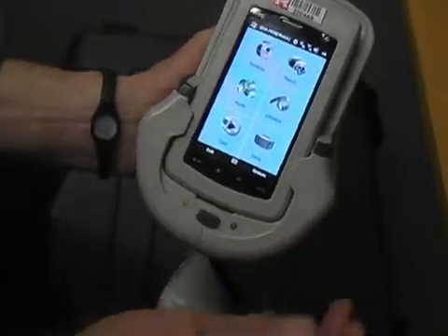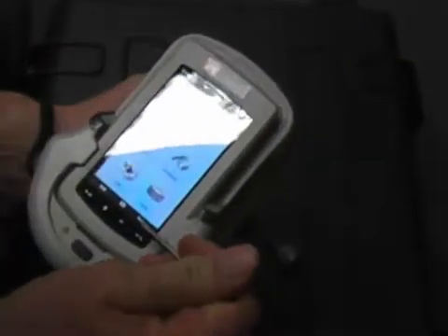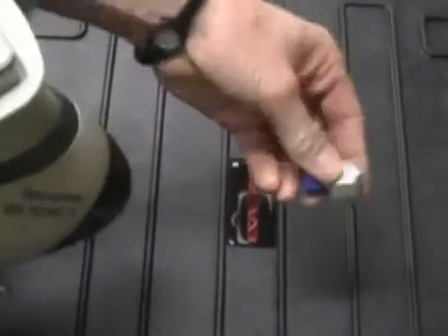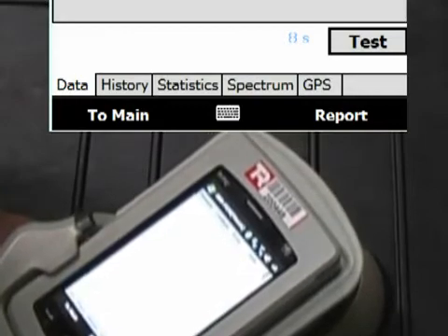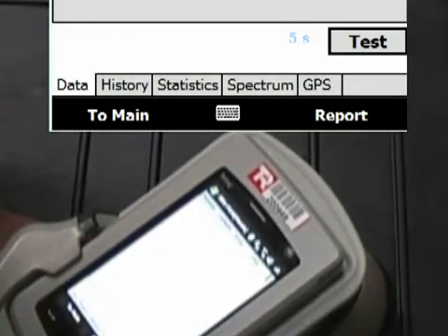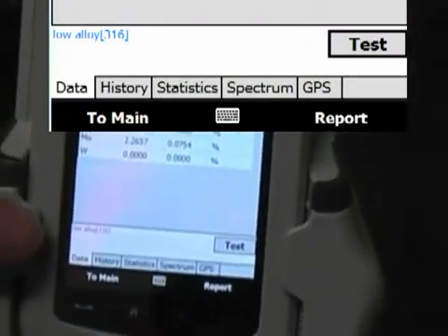Click on here and open this window, get it ready for testing. Set to match — we've set the system. Now I need to test this sample here on the bench. I'm going to hit the test button and point this at the sample. You can see it counting down. You can hear the bell when complete. There are the results — it says here that it's 316 stainless.